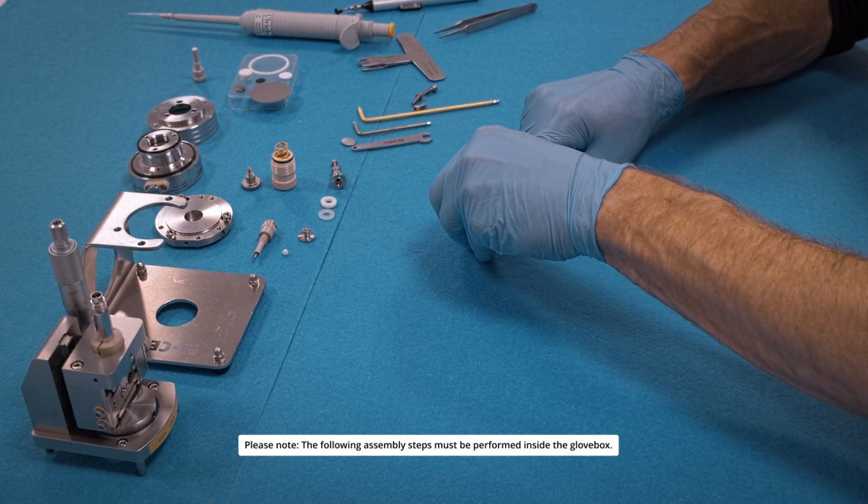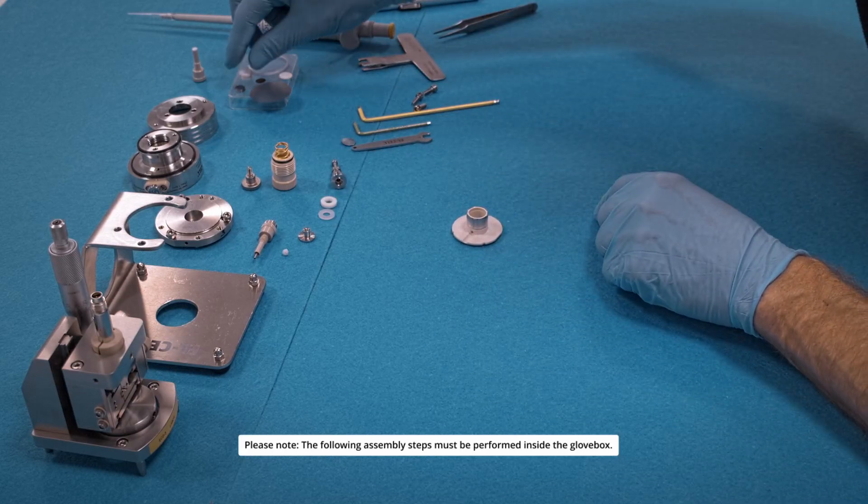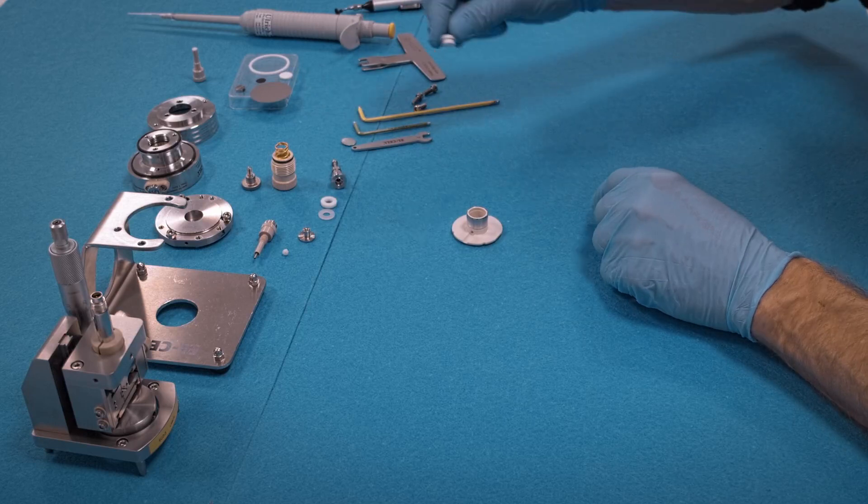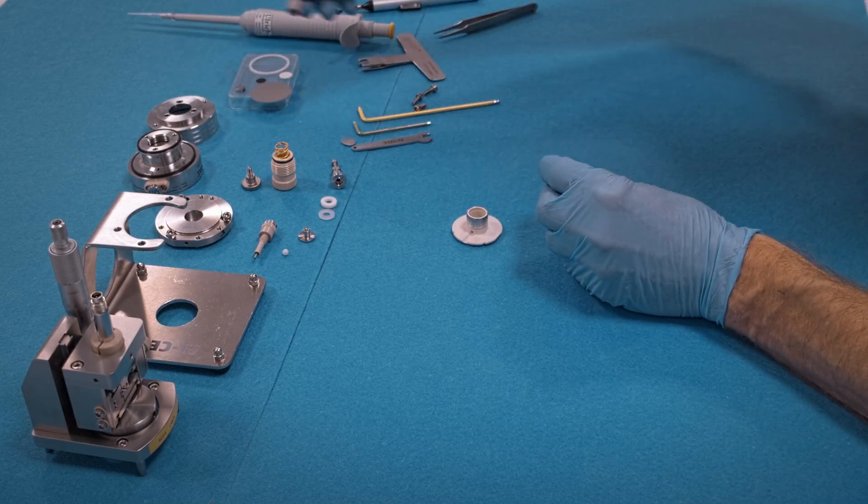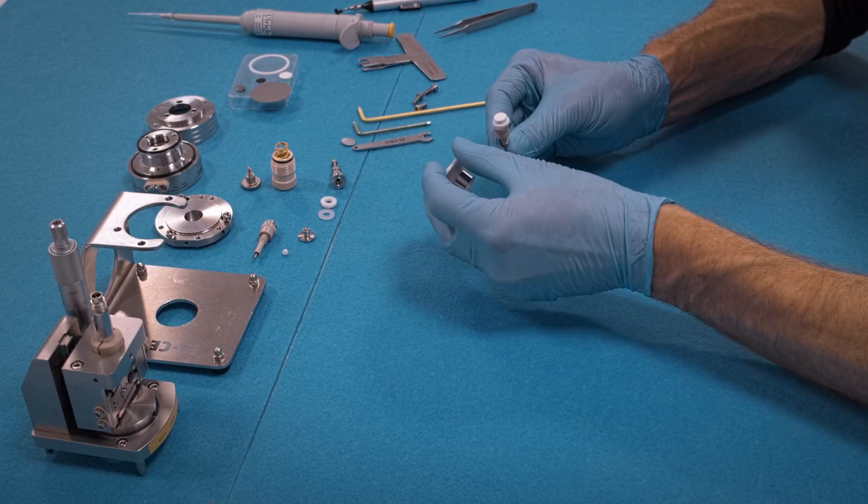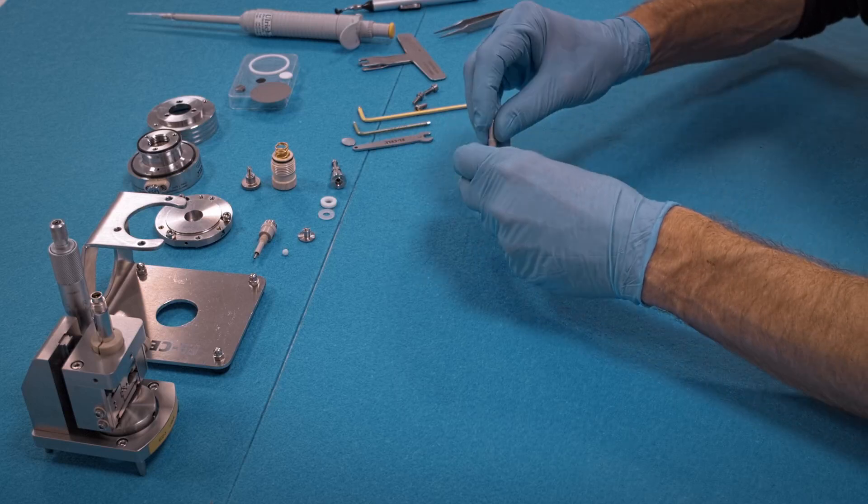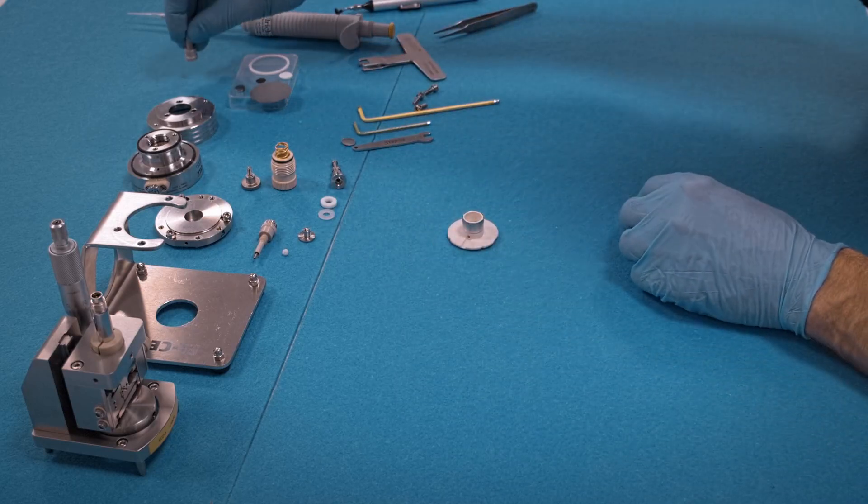We push the support ring onto the flange, then insert the glass frit. Put the glass frit on this little helper here, push the flange over the frit, and turn the assembly around.